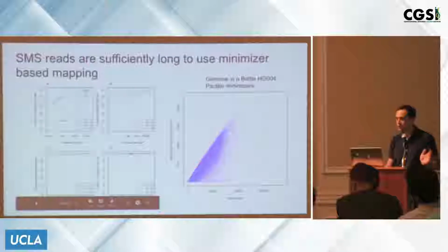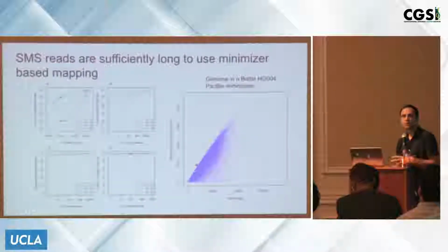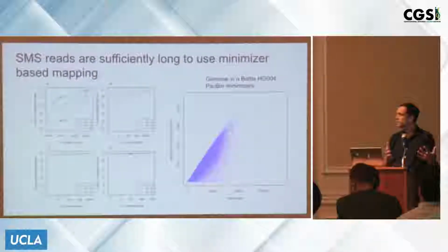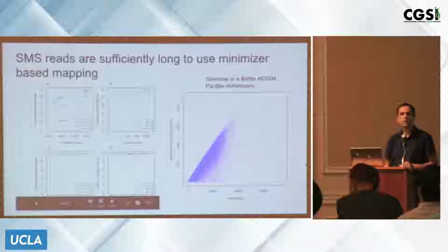By and large, the minimizers of course scale with the read length, and most reads have a very large number of matches between the reads and the reference. What this tells us is that it's getting much, much easier to do alignment now than before. We just have to find minimizers and look for clusters of this order of magnitude.